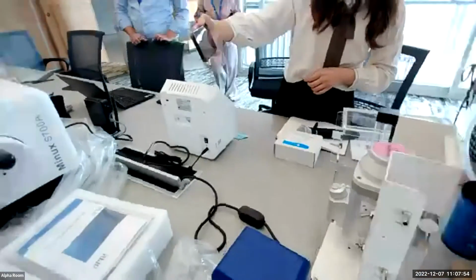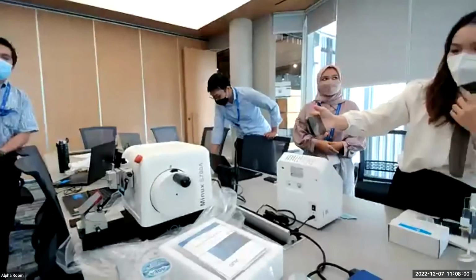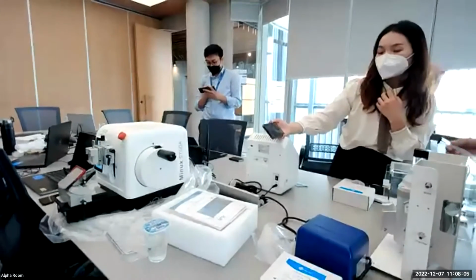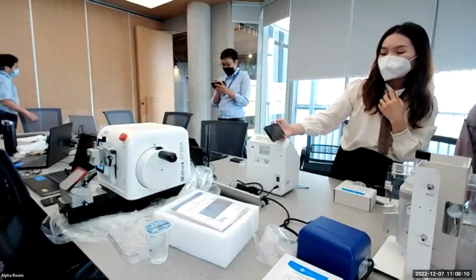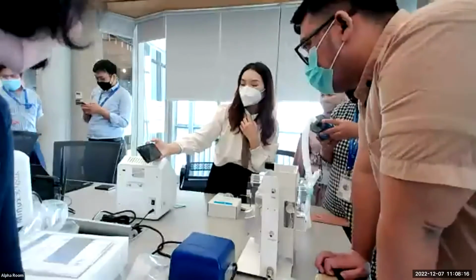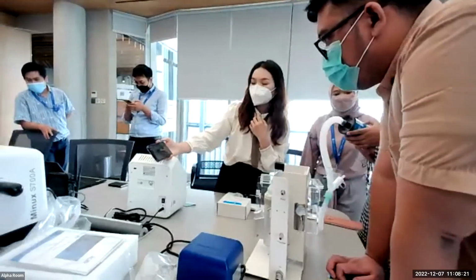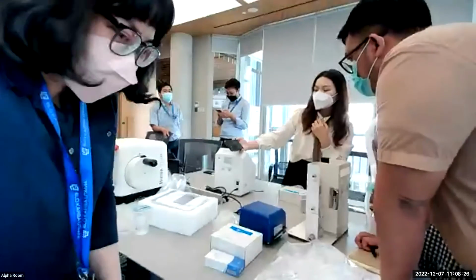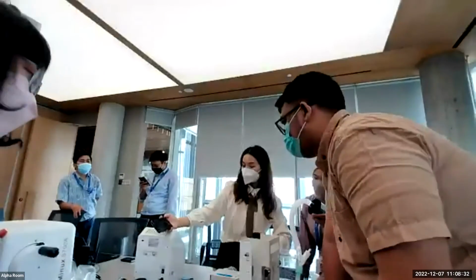I just said that if we use a cone mask, we cannot use it with this gas evacuation apparatus, because inside this small tube, you look inside here, this small tube is connected with the anesthesia machine. So if we connect this one, the gas will directly pop away from here. So we only use it with this canister.